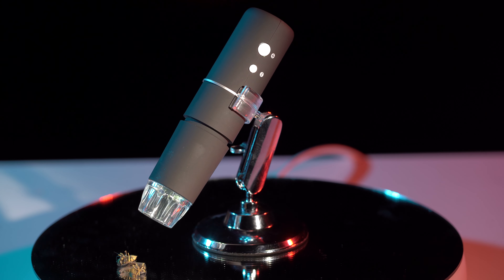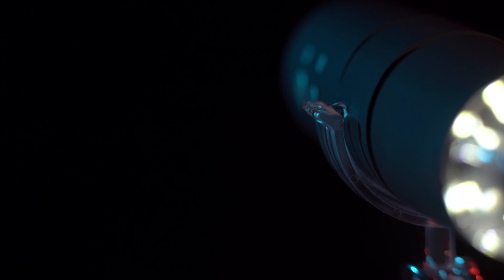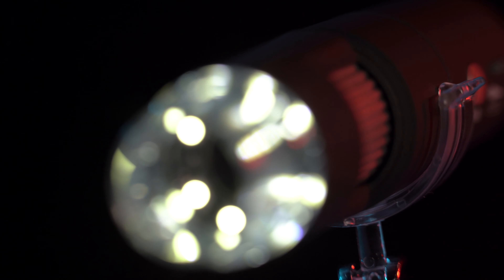It has a little turn on it, and when you turn it you can zoom in. It has a light. This cost me about $40 on Amazon, which I will put the link down below.